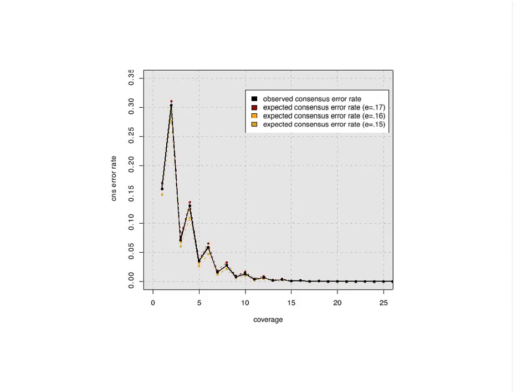Yeah, the only thing I would add to that is that if you look at the all paths approach, they actually rely on the Illumina jumping libraries to resolve the repeats and the PacBio reads to fill the internal structure of the repeats. So I think this gets back to the point that Adam brought up, that as these PacBio reads get longer and longer, it becomes more difficult to figure out what path they correspond to in the De Bruijn graph because the path is longer and longer and there's more and more options to go through to get from one end of the read to the other. So I think that's a limitation.